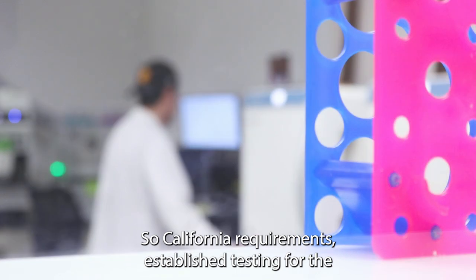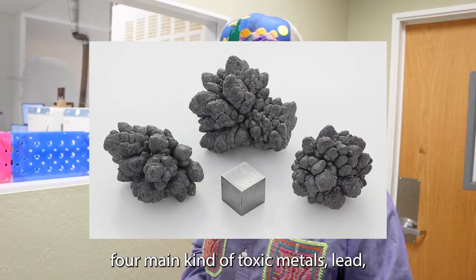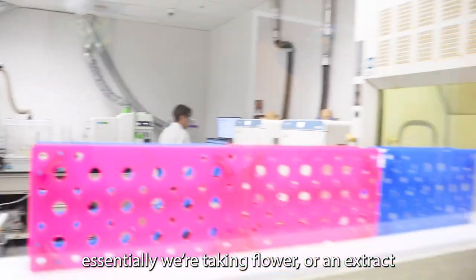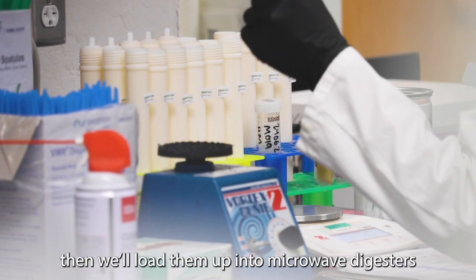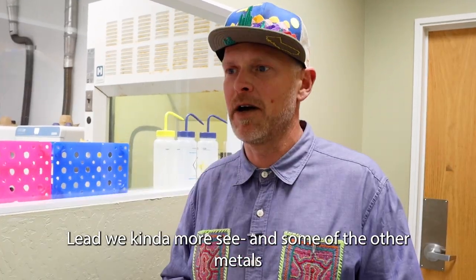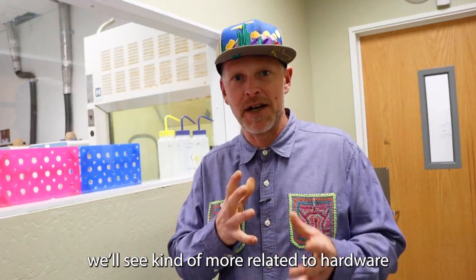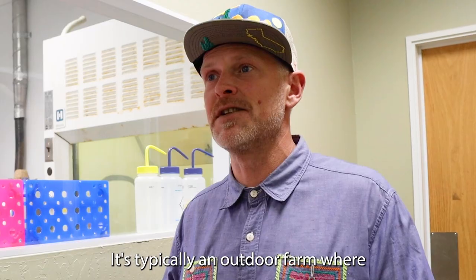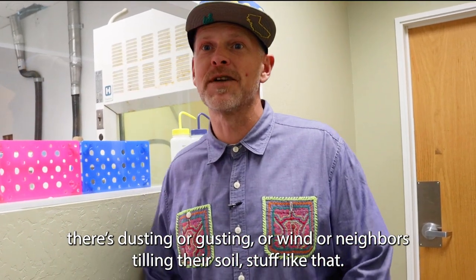This is our heavy metals laboratory. California requirements establish testing for the four main toxic metals: lead, mercury, cadmium, and arsenic. We take flower, an extract, or a cartridge, put them in a compression tube, then load them into the microwave digesters to digest whatever we've put in. We tend to see lead and some other metals related to hardware — embedded cartridges that might be leaching. When flowers fail, it's typically an outdoor farm where wind or neighbors tilling their soil causes contamination.